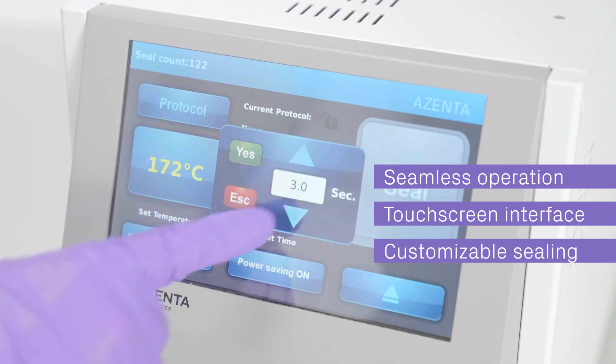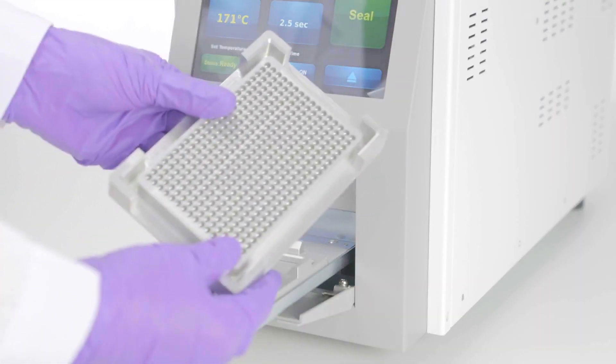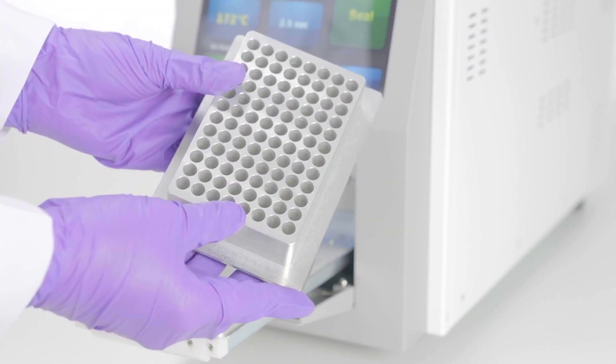Plus, with unlimited password-protected protocols, three security levels are available to save personalized and SOP-set temperatures and times — great news for researchers sharing a lab.